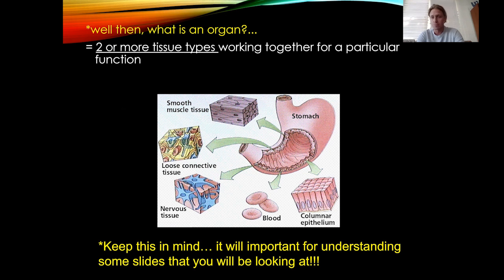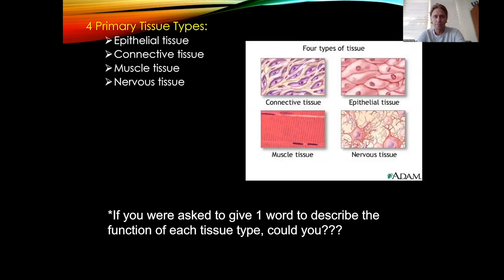And we have directional terms when it comes to histology, which is the science of looking at this under a microscope. If something is towards the lumen, we say it's more apical. While if something's away from the lumen, then we're going to say it's more basal. So you'll see those terms a lot. And I'm going to use those terms pretty freely, so just make sure you understand what they mean. Apical means towards lumen, basal means away from lumen.